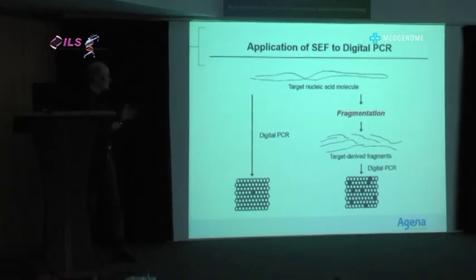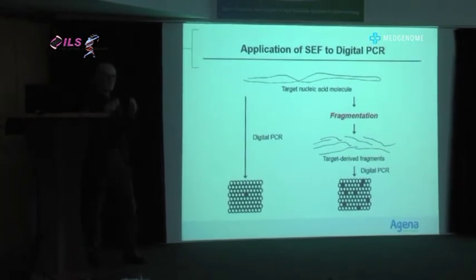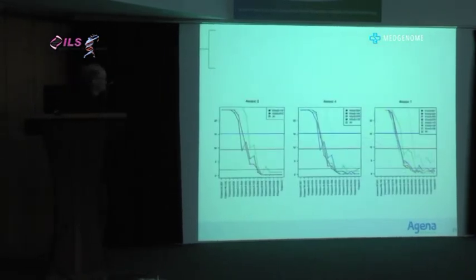The way to improve signal to noise is to take the molecule and cut it up into lots of pieces and design a multiplex assay which goes for any or all of the pieces. Now, instead of having one molecule, de facto, I have many molecules. And so my assay sensitivity goes up. It's that straightforward. You can't do this with real-time PCR because you can't multiplex. But you can do it with the MassARRAY system. And here's an example.